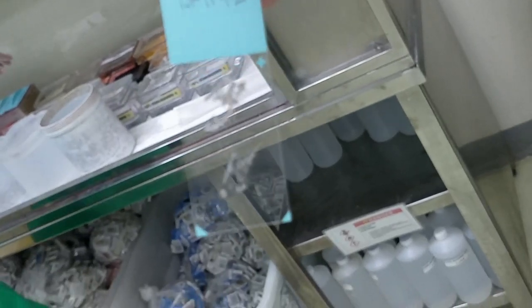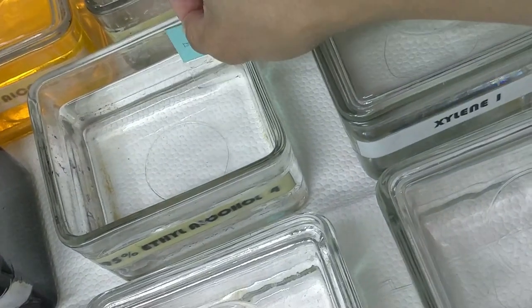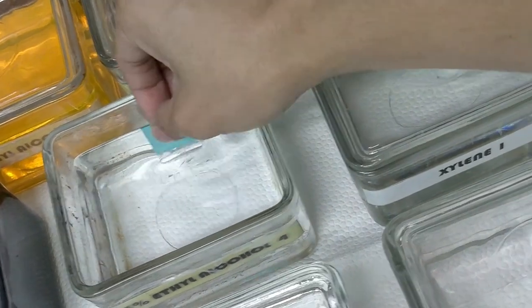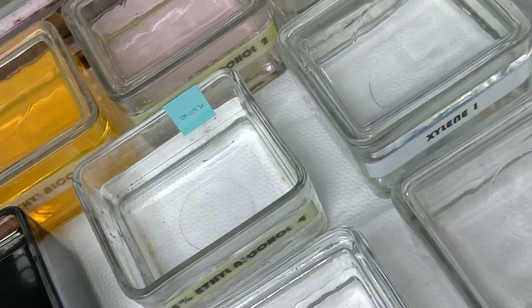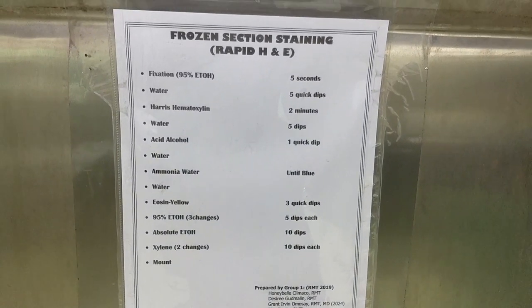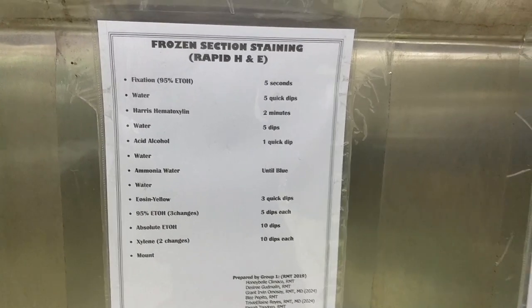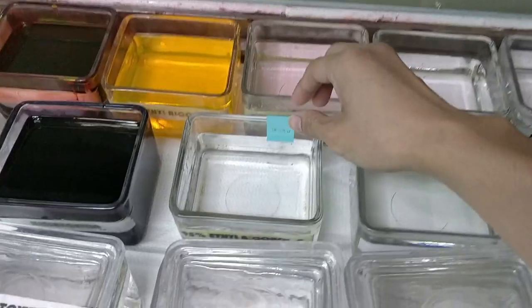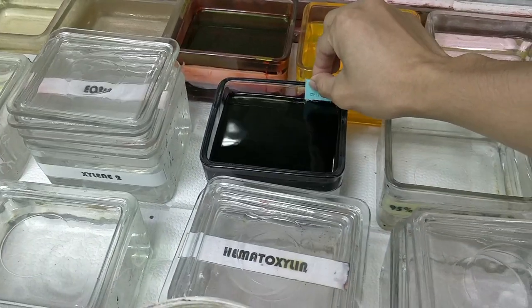So, the slide is prepared first, no? Then the specimen goes into ethyl alcohol. It has the same steps as for rapid staining of our H&E, so we're just gonna follow that, no? So we take it out and rinse it a little. Then we're gonna leave it in hematoxylin, no?